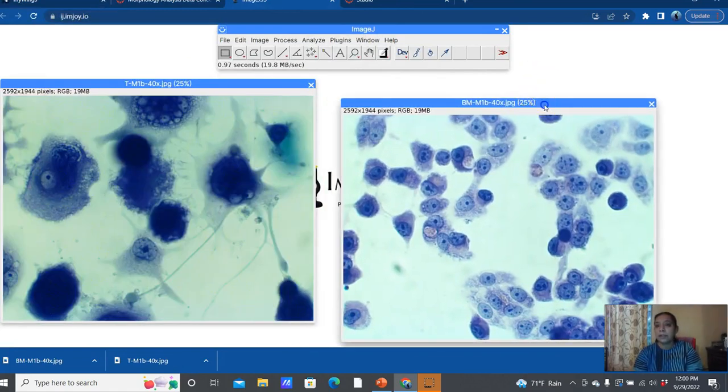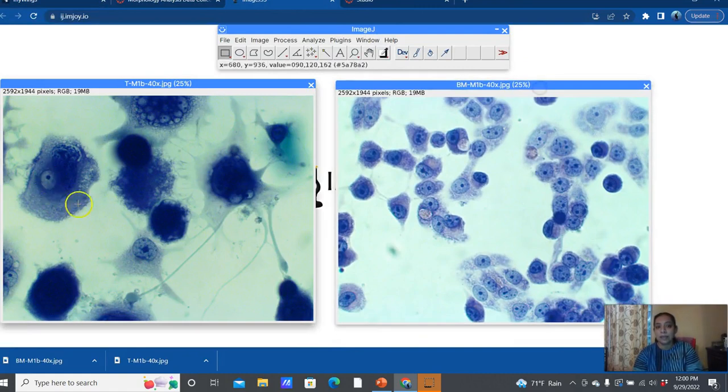These are both taken using the 40x objective lens, so you can kind of see the difference in the size of the cell in these two, right, up front. It's just amazing how different the same cell line looks with a different treatment. So this one is black mulberry treated, and these are some Taxol treated cells. So I'm going to go ahead and show you some things that we can do with these images.